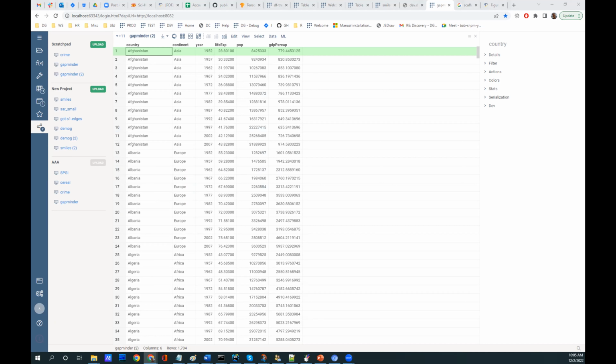Also, suppose you have a table shared between two projects, and then you make changes. You open one project, and you may not even open the other project that has the table, which may not even be opened in your environment at this point. You make some changes, for instance, you remove certain rows or add columns or compute something that adds columns.